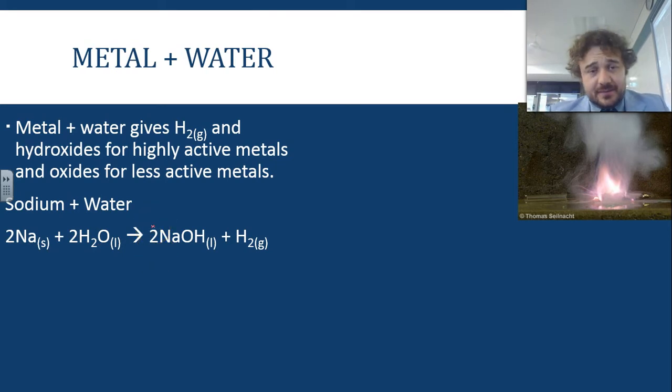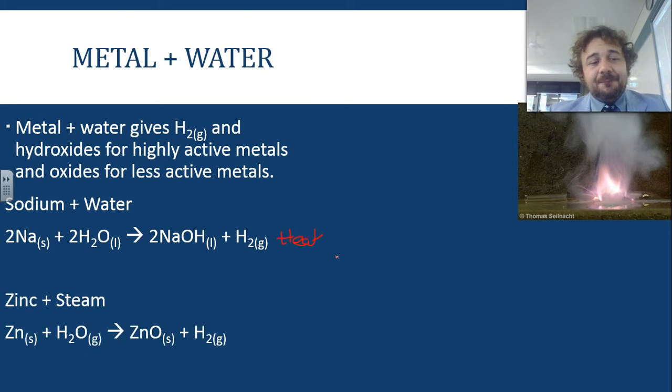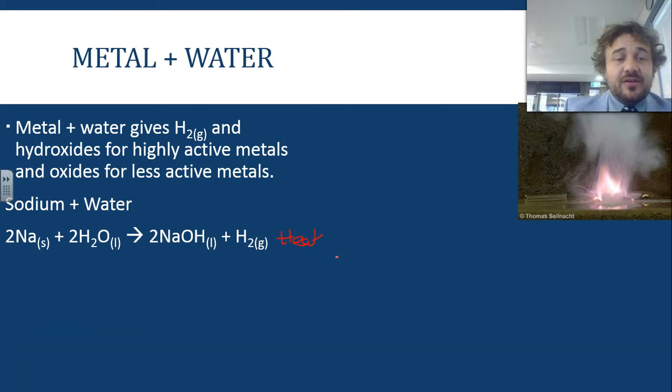Now, it explodes. The reason it explodes is that it's producing hydrogen gas, and this also gives off heat. So it gets really hot, and that heat reacts with the hydrogen and causes it to combust. So that's sodium and water. Sodium is very reactive.